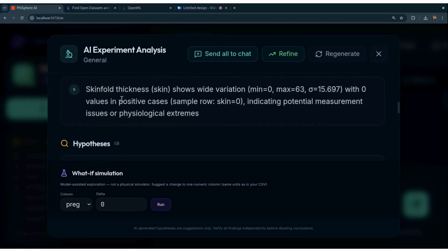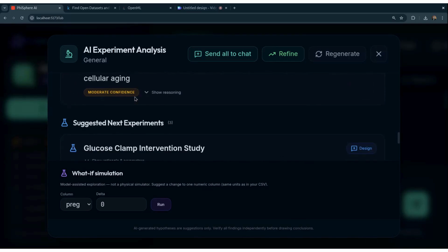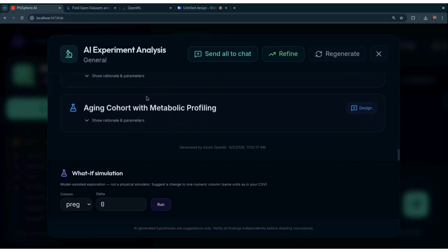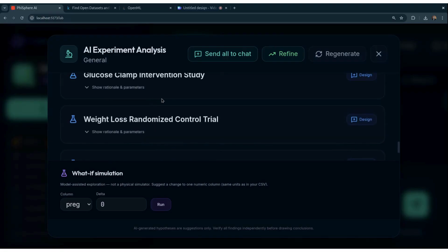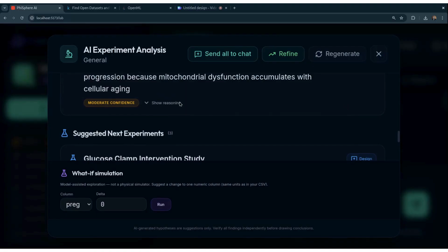When you demonstrate export, say that it is the bridge between your conversation and your documentation. Export captures the important reasoning and context so you do not lose the evidence trail from the assistant. That is especially important in research because the why matters as much as the what.